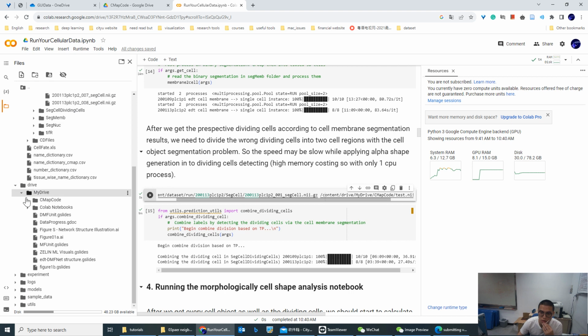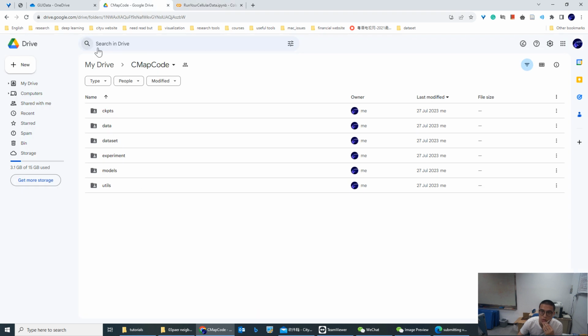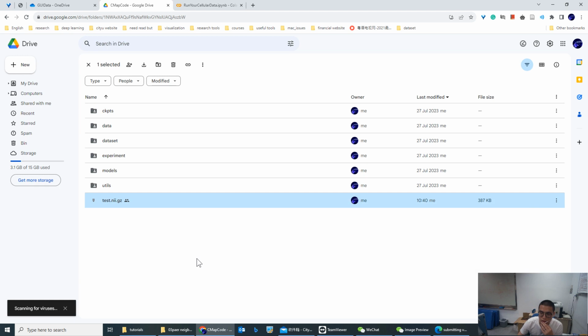Check it out. Hit here, and then check your Google Drive. Now you can download it on your computer.